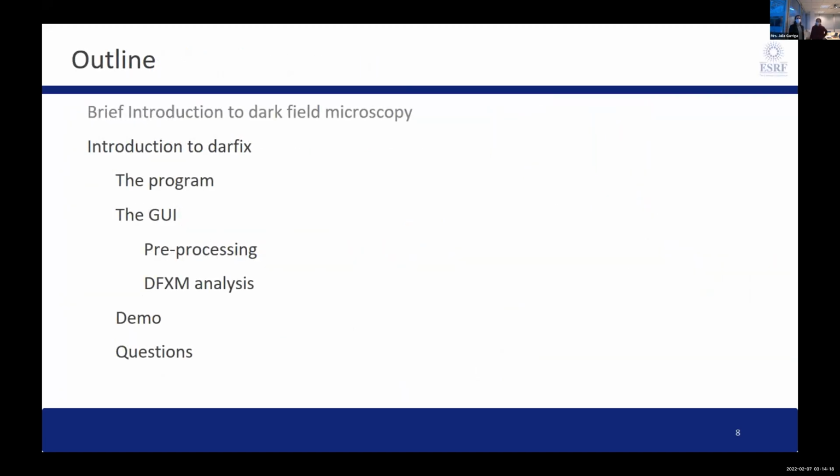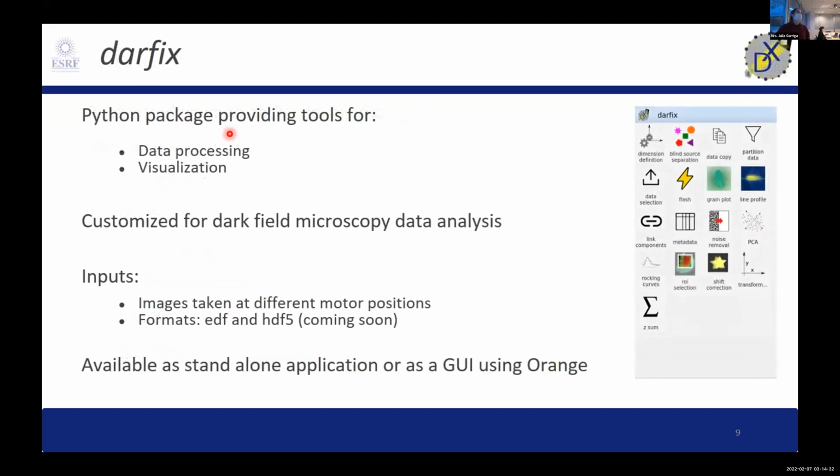And now Julia will introduce you to the program. Thanks, Raquel. So now I will start by telling you what Darfix is and how to use it, which is the main purpose of this tutorial. First of all, Darfix is a Python package for the analysis of dark field microscopy data.